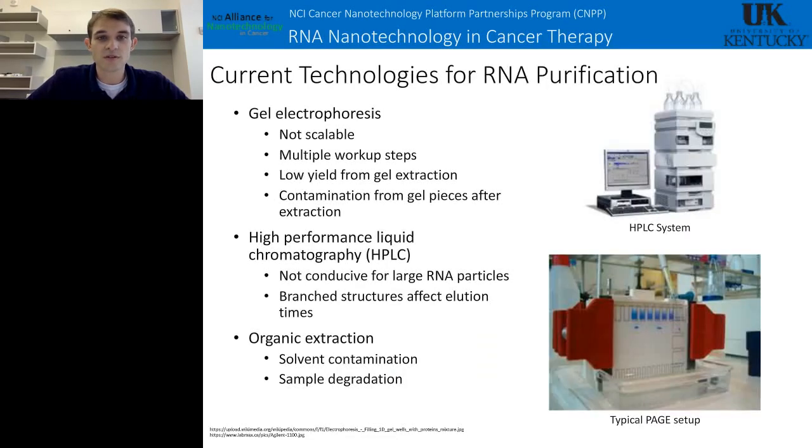So some current technologies, and as a lot of you know, because you all answered the poll questions and all three of these were on there, except ultracentrifugation. There's gel electrophoresis, HPLC and FPLC, and organic extraction. These methods definitely do have their limits.